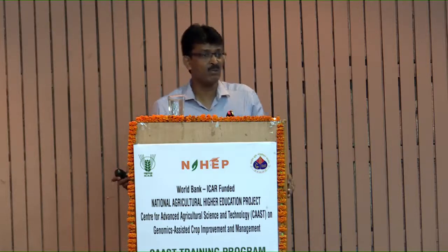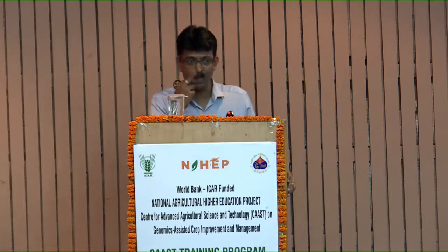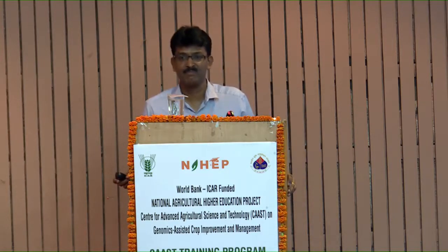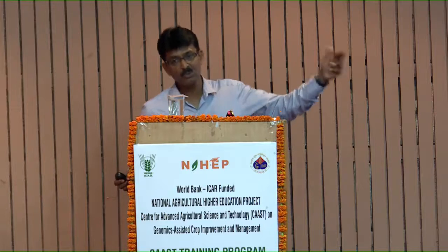Is it clear to all of you? There are two things. One is primers: you have a COX-specific primer. And what is the probe here? The probe is nothing but a short nucleotide sequence which is complementary to the same gene which you are targeting in your PCR.